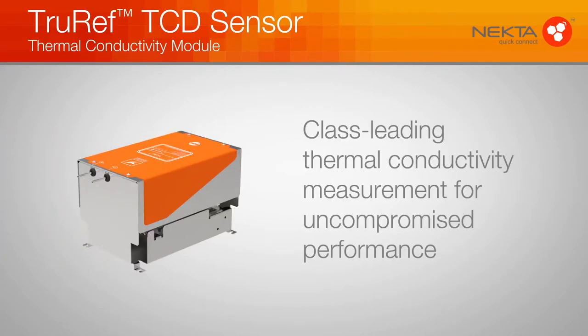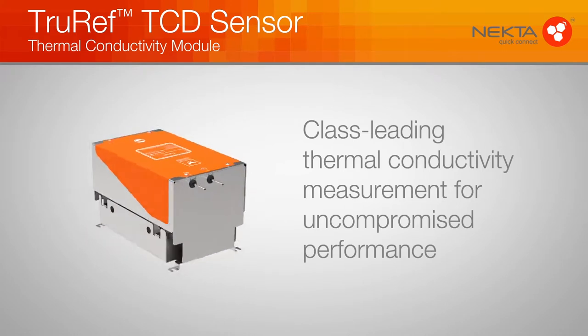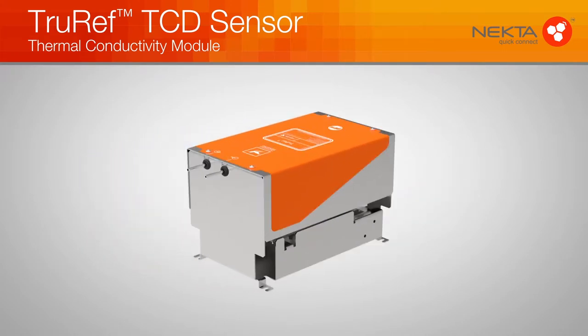The TruRef TCD from Hummingbird Sensing Technology. Suitable for binary gas measurements within analytical impurity applications.